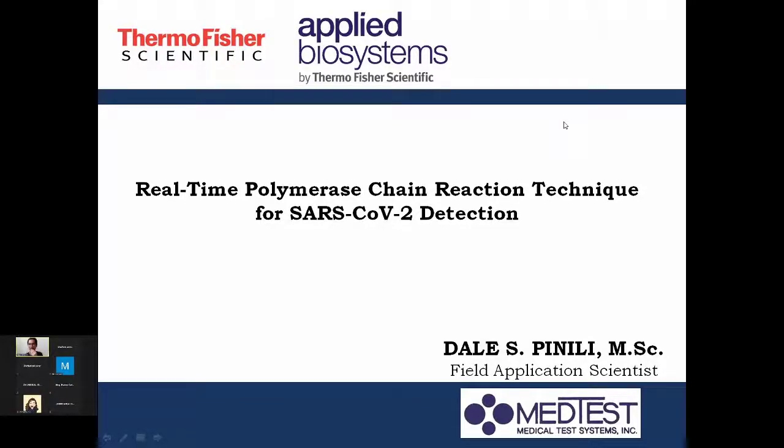I'm from MedTest. So I'm going to discuss the principles of the real-time polymerase chain reaction technique to be used for COVID-19 detection, or the detection of the virus SARS-CoV-2.